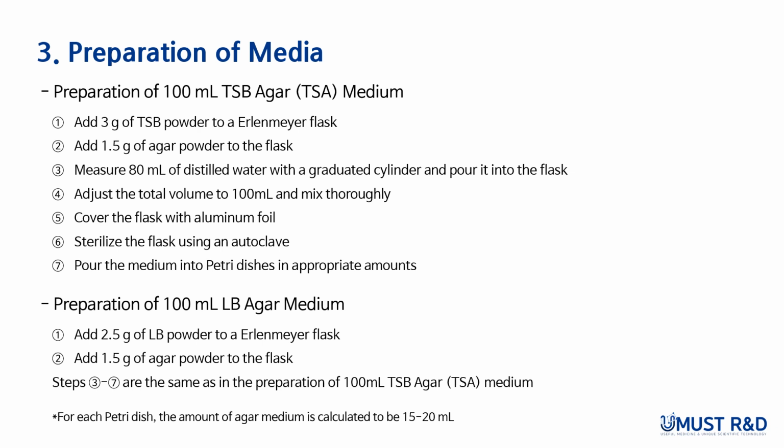In this lecture, we have learned about the concept of culture media for microbial growth, the different types of media, and the process of preparing this media in the laboratory. Understanding how to prepare and use media is essential for successful microbiological experiments. With this knowledge, you will be better equipped to work with microbial cultures in future studies and research.